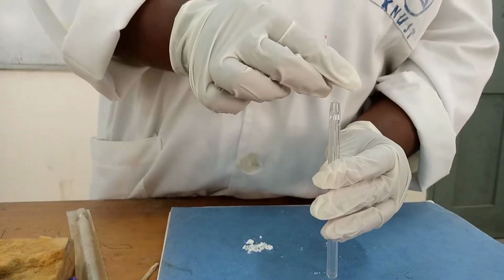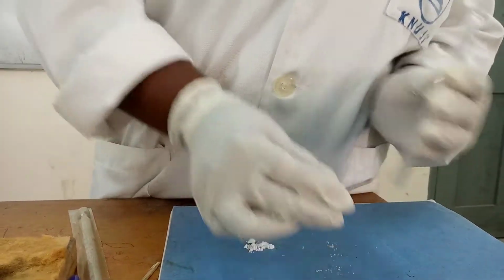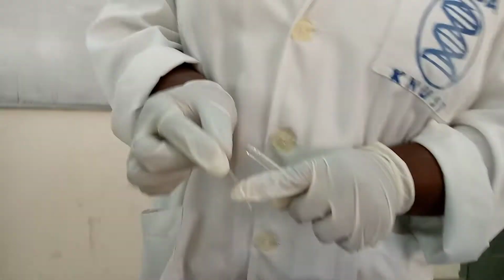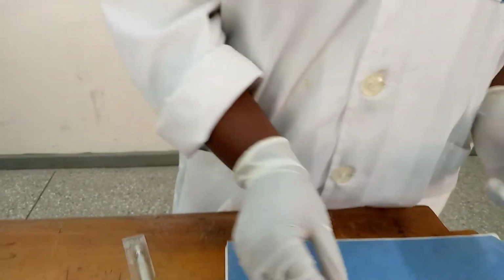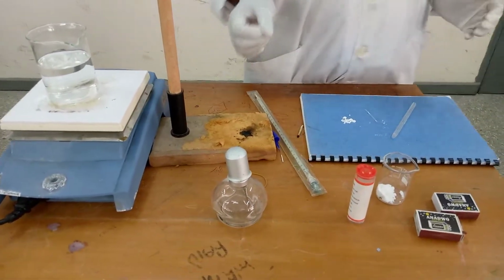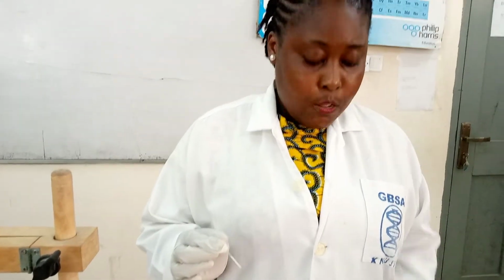So this is how we fill the capillary tube with our sample. So you see, it is dropping little by little. Okay, so this is how we fill the capillary tube with our sample, but I've already done that. Yes, I've done it, and I just wanted to demonstrate how to do it.